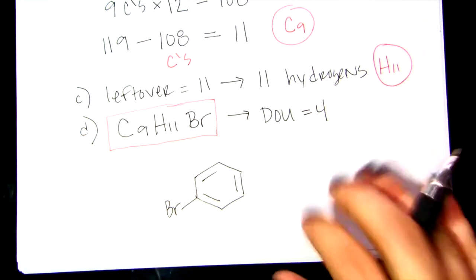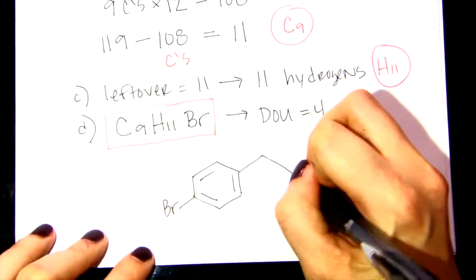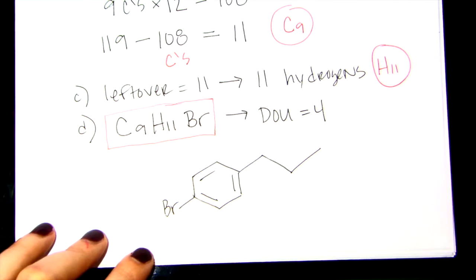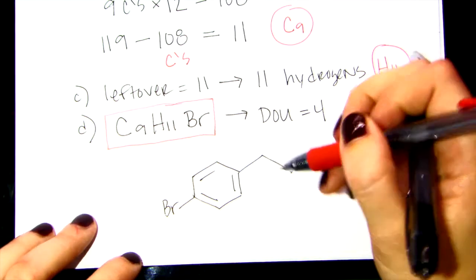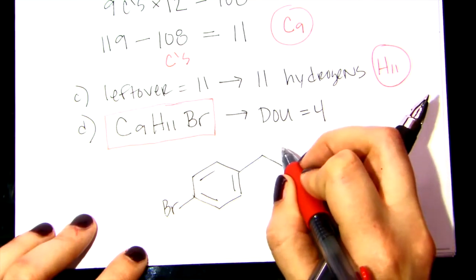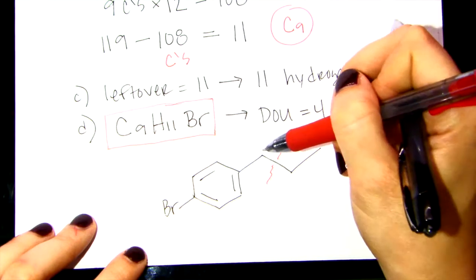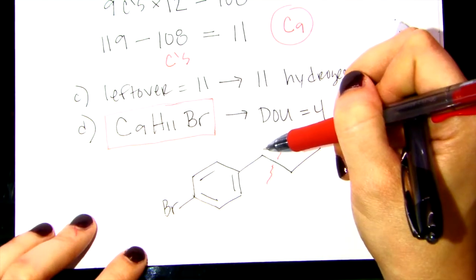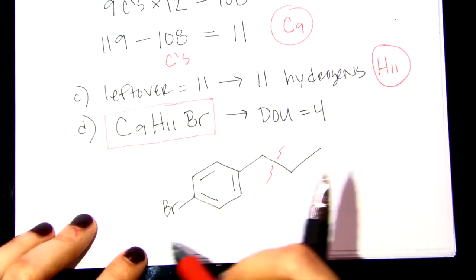What happened there? Okay, so I might put 3 more carbons. I might propose just a propyl group. Again, it doesn't have to be that, but this makes sense with the fragmentation also, because we're observing an ethyl group falling off, which would give us a benzylic cation, right? So that would be really stable. And so this could be a possible structure of that big fragment peak.